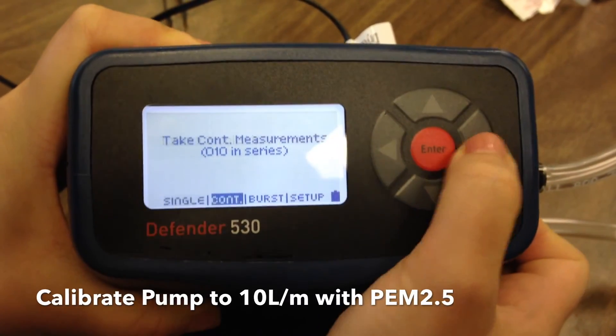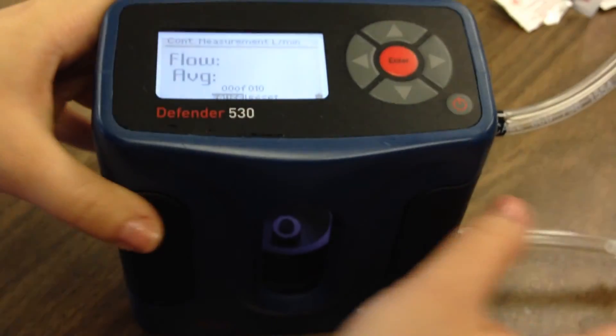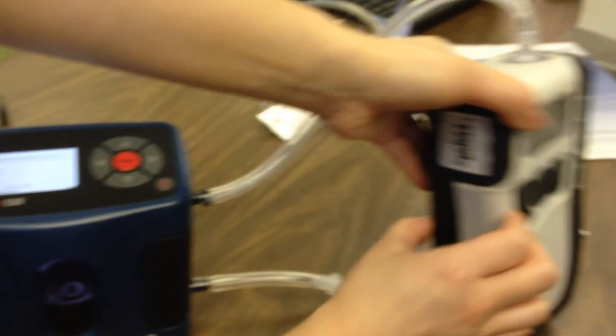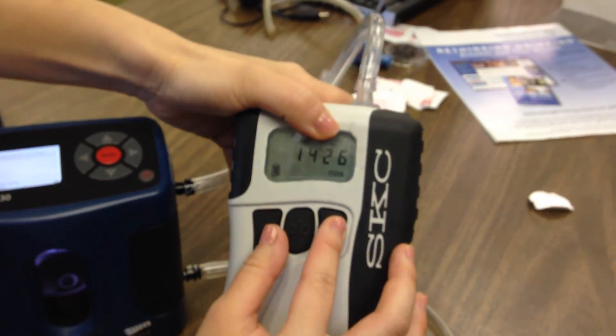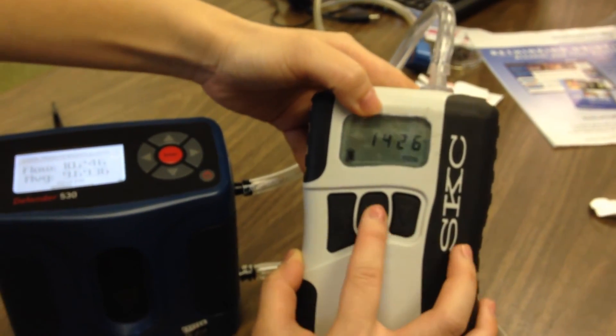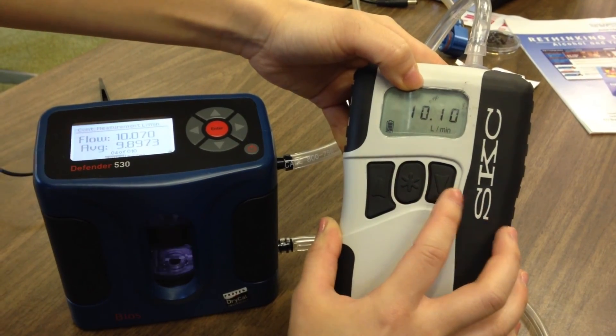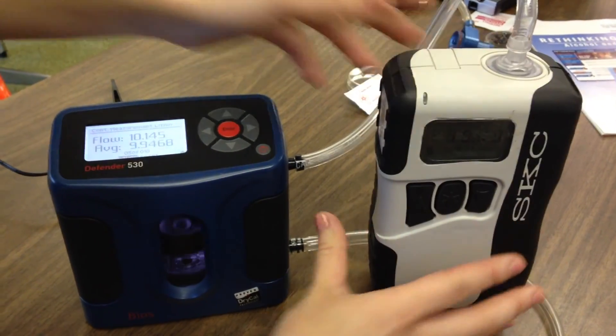In order to calibrate your pump, select Measure, then Continuous Measurement on the calibrator to begin measuring airflow. Connect tubing directly from the pump to the outlet at top and tubing from your PEM cut point to the inlet at the bottom of the calibrator. Leave your calibrator running for 5-10 minutes.